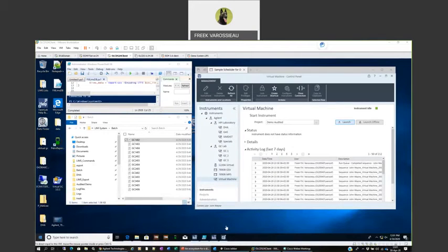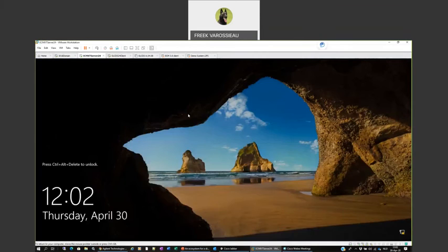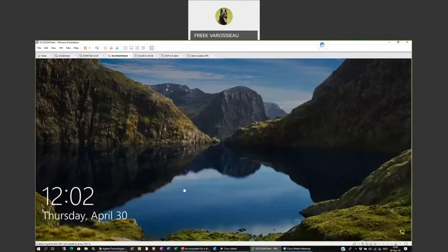So you have now a nice view of my PC, and what I have provided for you here today is a client server system. So I have here an ECM server. The server is both LIMS server as well as it is the OpenLab server, as well as the sample scheduler server. So 3 jobs in one system. And then I have an OpenLab client, which then is the sample scheduler client, but it's also running the instruments, and providing me the user interface. So client server in this case.